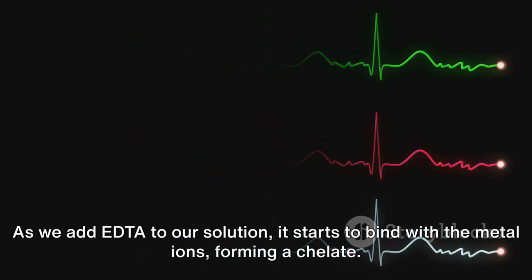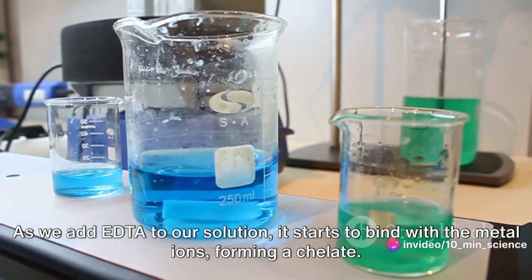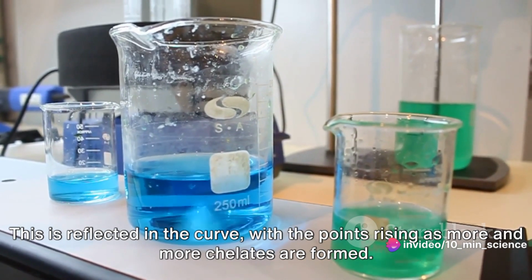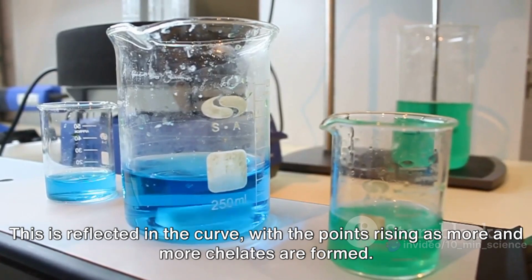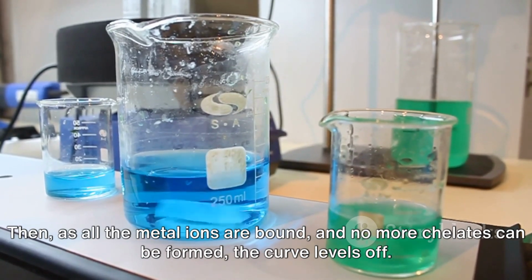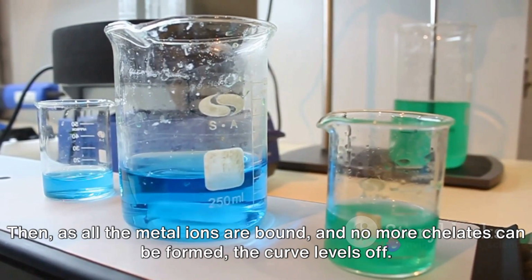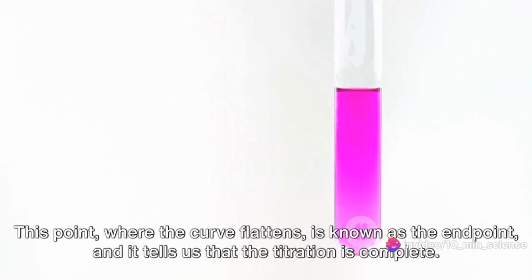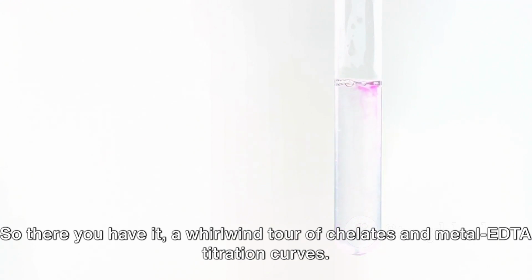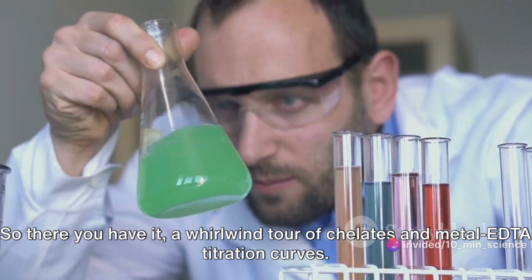As we add EDTA to our solution, it starts to bind with the metal ions, forming a chelate. This is reflected in the curve, with the points rising as more and more chelates are formed. Then, as all the metal ions are bound and no more chelates can be formed, the curve levels off. This point where the curve flattens is known as the end point, and it tells us that the titration is complete. So there you have it, a whirlwind tour of Chelates and Metal-EDTA titration curves.